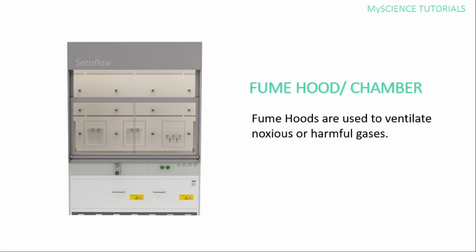You add maybe reagent A to reagent B. The gas is evolving. You leave it in the fume hood so that the gases, as they come out, the fume chamber will channel them outside so that you don't have direct contact with the gases and inhale them.